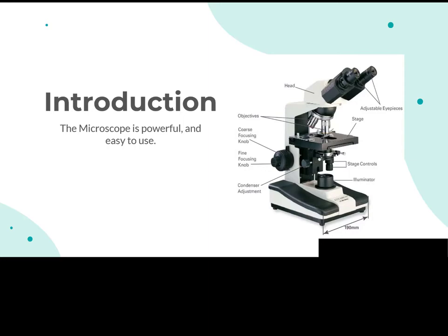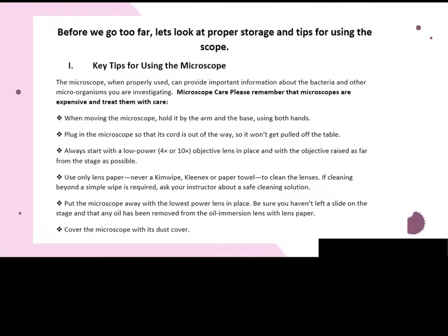In a microbiology lab, the microscope is sort of the crowning jewel. We always use both hands when carrying it — one hand underneath and the other holding the arm. When we plug in the microscopes, we don't unravel the cords unnecessarily. We always start with the scanning or low power 4x objective.